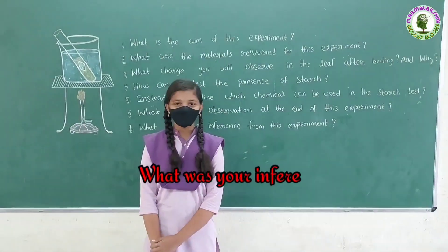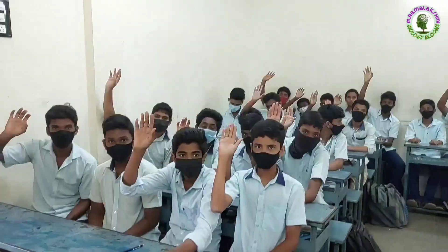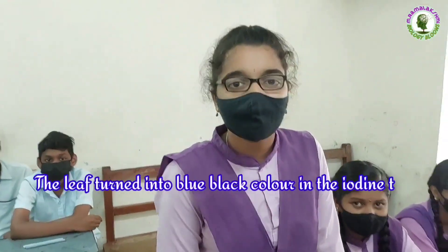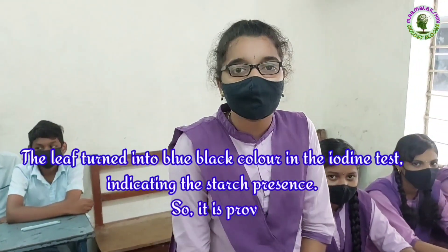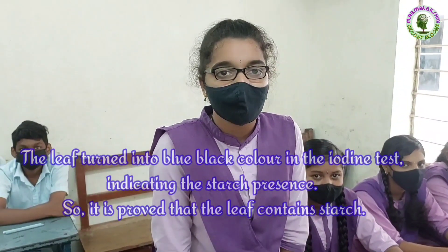What was your inference from this experiment? Ganeshwari: The leaf turned blue-black in the iodine test, which indicates the presence of starch. So it is proved that the leaf contains starch.